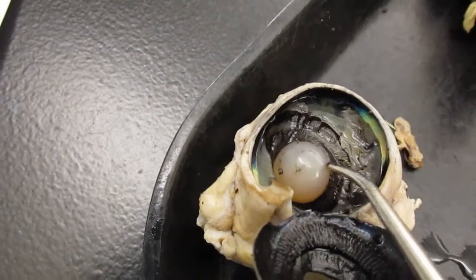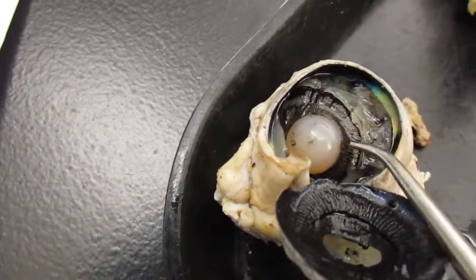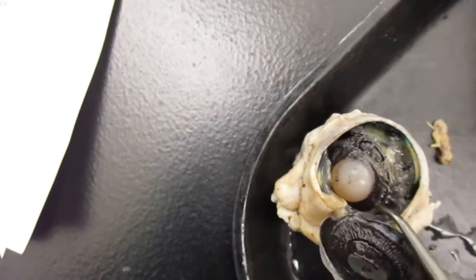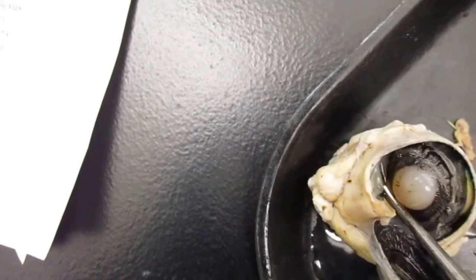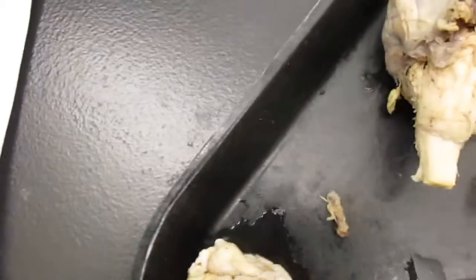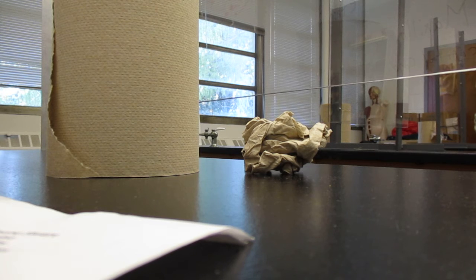Now, we have this stuff that's inside. This right here is called the lens. The lens is right here. This gelatin looking stuff is called the vitreous humor. And let's just dump this out here. Let me put the camera down, and I'm going to dump this stuff out in the tray.